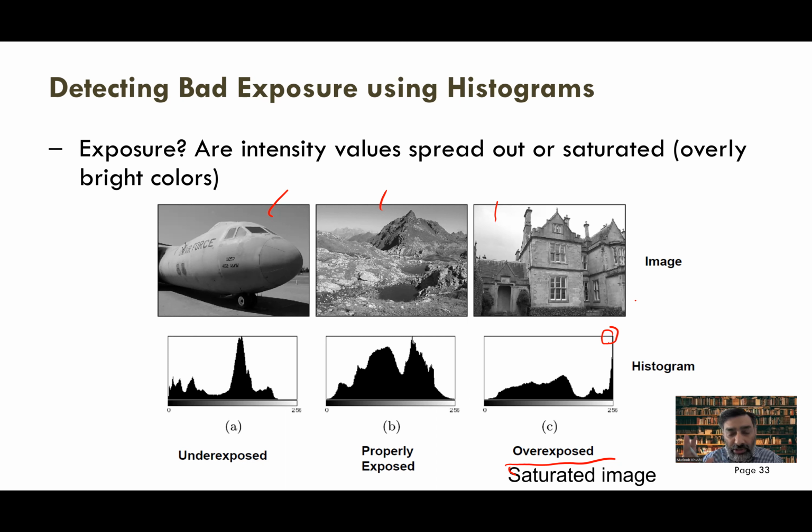All the microscopes, all the sophisticated machines, have knobs on the machines and in their software where you can do some adjustment and avoid this situation. If there are only 1 or 2 pixels having 255 value, maybe that's not a problem. But if it's more than that, in a perfect scenario, there should not be even a single pixel having an exact 255 value. Everything should be below that. If that happens for quite a number of pixels, then your experiments are overexposed. They are getting a lot of light.